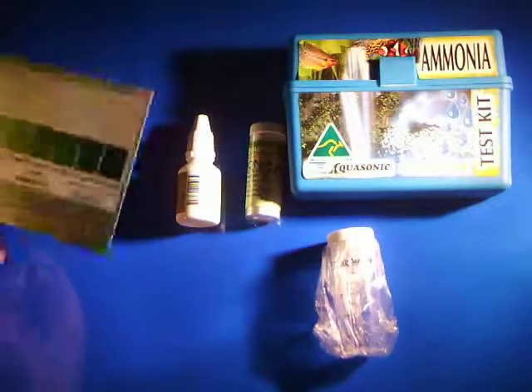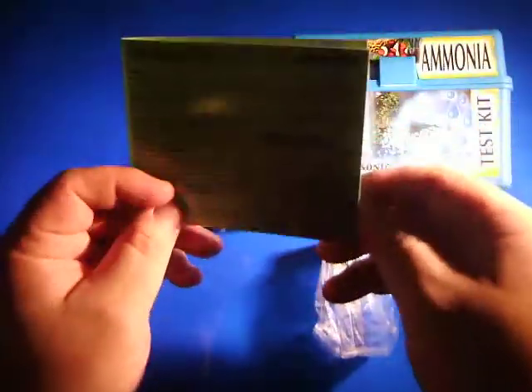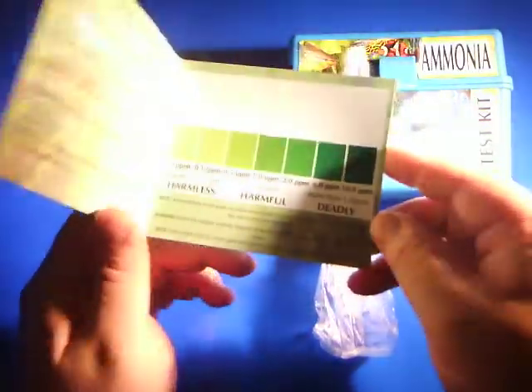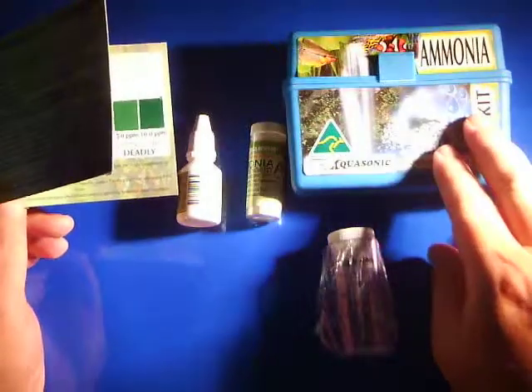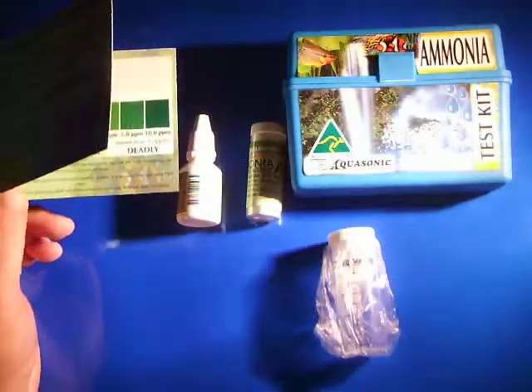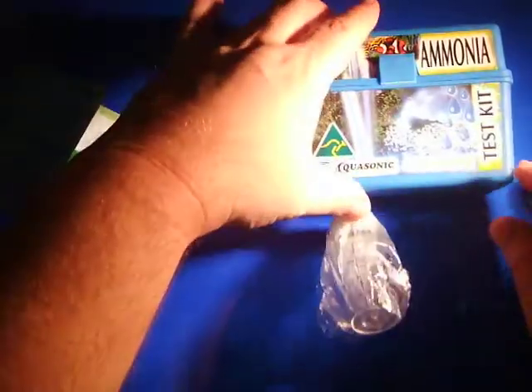It's a great little test kit to know exactly where you're at. The instructions are done in laminate, not paper, so if they get wet they're not going to fall apart and you won't be left not knowing how to use it. Same with the actual case — done in plastic, because you're going to be around water when testing. So you need something that can handle the water. And it all wraps up nice and easy, going back together neatly and kept nice and dry.